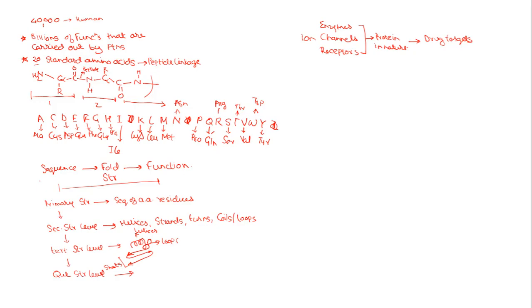Say, for example, if you are good at analyzing protein structures, it becomes much easier for you to locate where the active site of the protein is, where exactly my drug would go and attach to that protein. All these facts become very easy if you are well versed with analyzing protein structures.